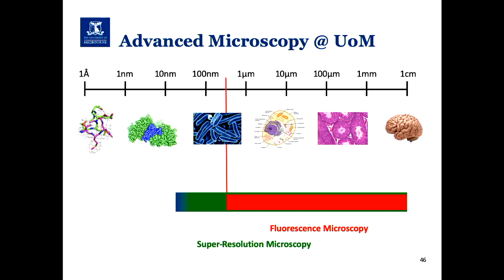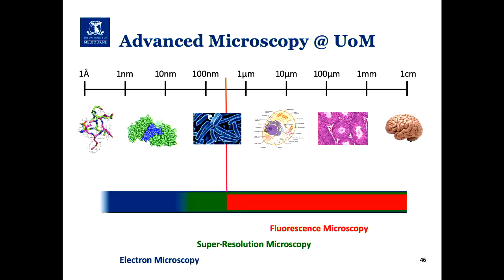That, as I said, can get us down to about 20 nanometer resolution. Once we need to go beyond there, then we're going to have to use a technique like electron microscopy. I'm not going to cover any of the EM applications today. I can put you in contact with the facility manager at Bi-21 if you're interested in those.